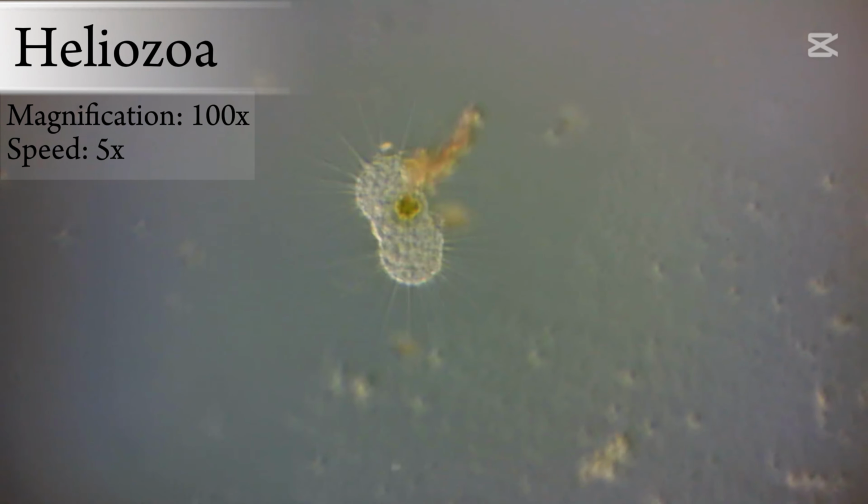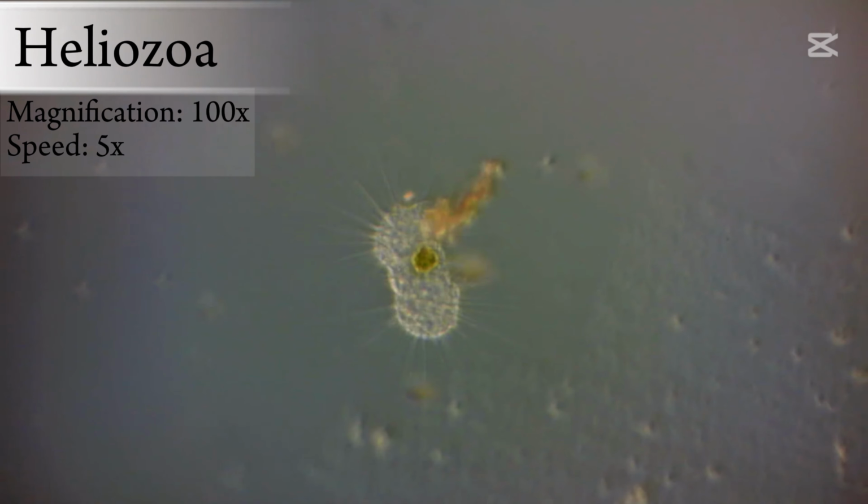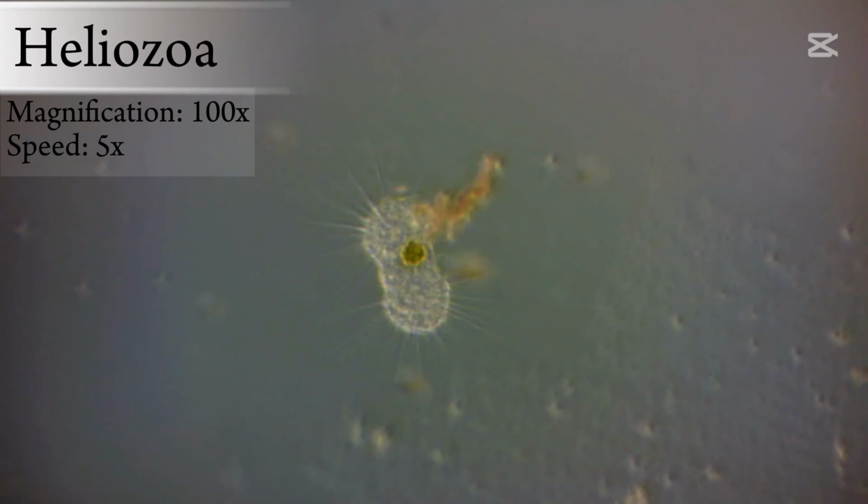Last time I was checking my water sample from my favorite sampler source, Ravas Waterdam. It is the richest diversity of all my samples. And for the first time I found heliozoa. Even though I have used a microscope for more than half a year, at least once a week, I had the honor to meet this guy just while recording this shot.